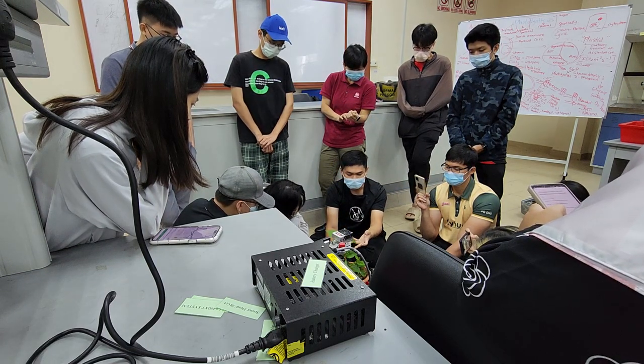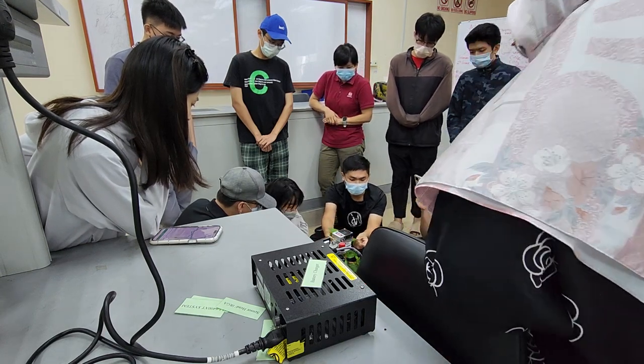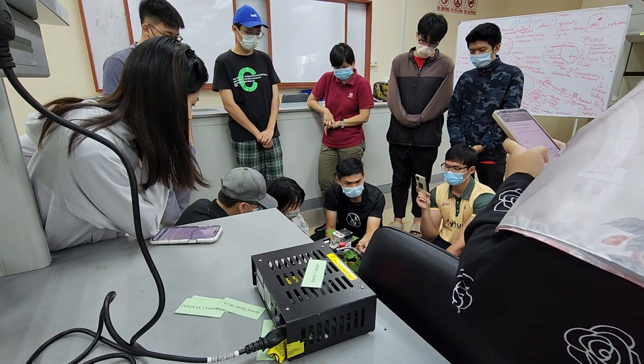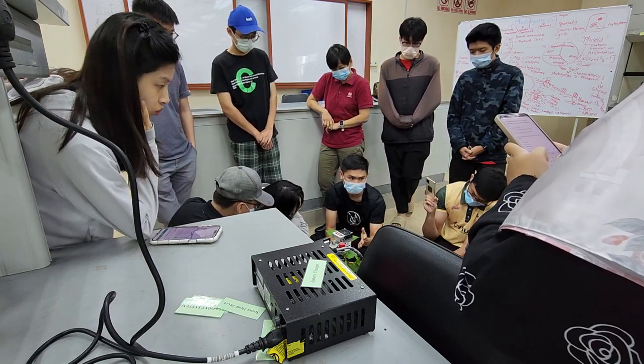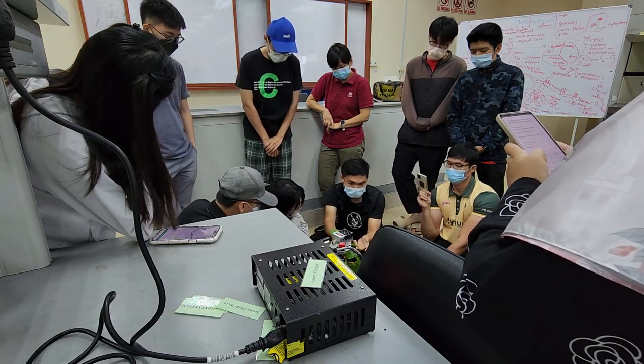How do we double confirm that? This is number 3, right? You look at number 4. Is it almost the same size? So this is already fully expanded. By doing that, you can confirm this is the leaf to take. So now we already know this is the optimum leaf to take.